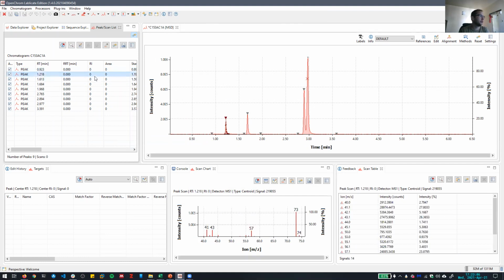So if you click on them, you can go through and see, down here, this is now the integrated signal of that whole peak. So this is how those areas are extracted that are in your integration reports files. I'm obviously not going to make you do that. Well, okay, we haven't got there yet. These are the retention times. So just from the peaks, we find the retention time, and it's taken at wherever the peak occurs.